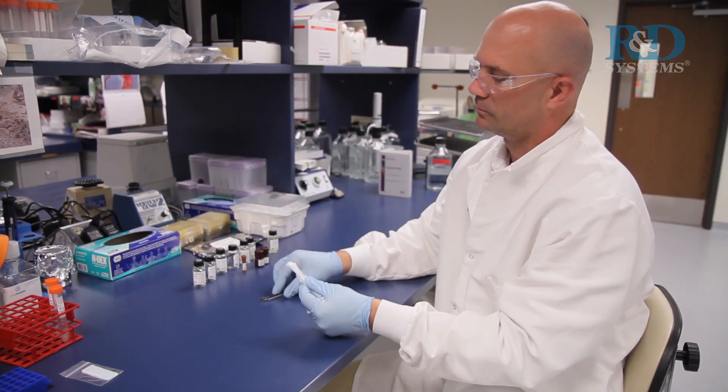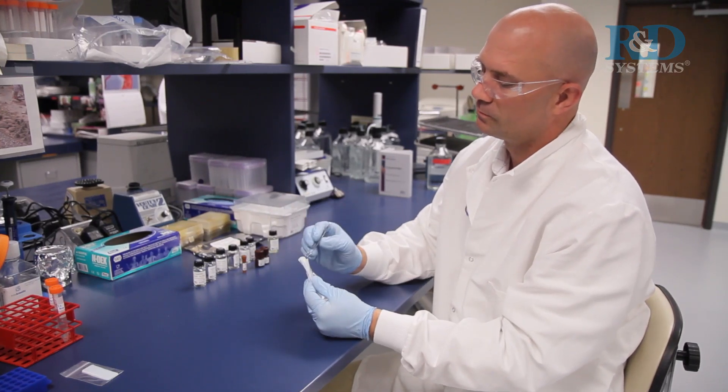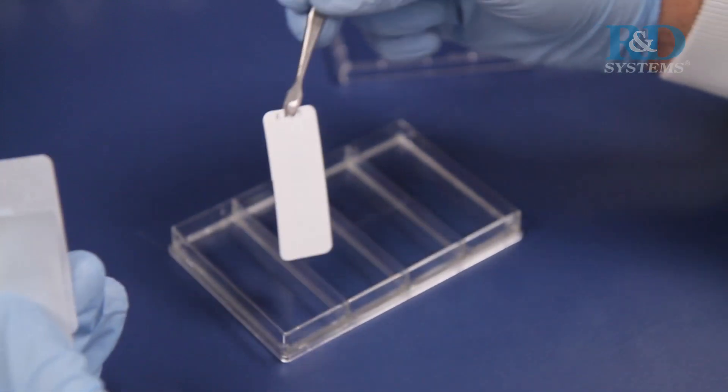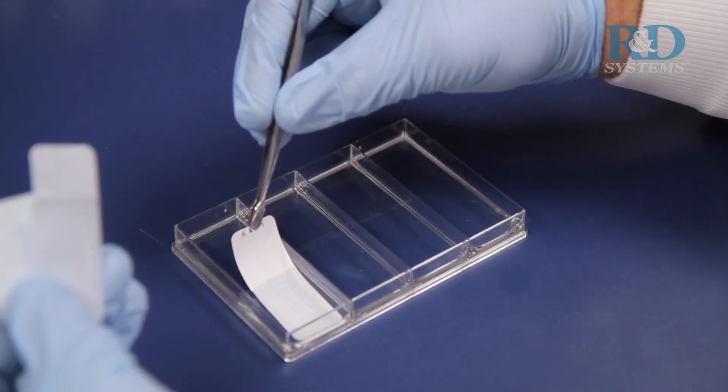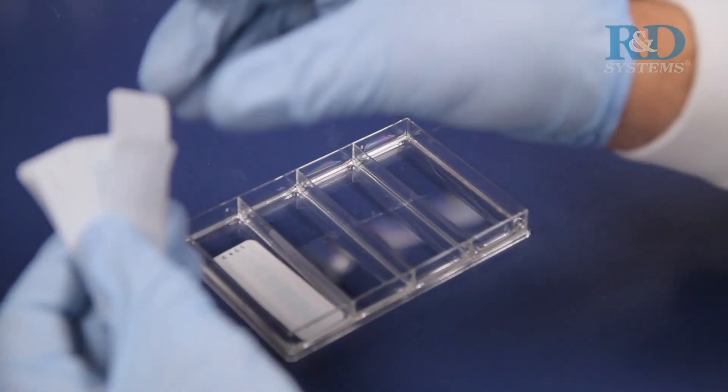Using flat tip tweezers, remove each membrane to be used from between the protective sheets and place in a well of the 4-well multi-dish. The array number should be facing upward.